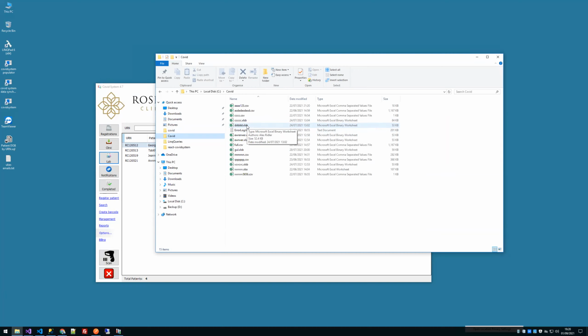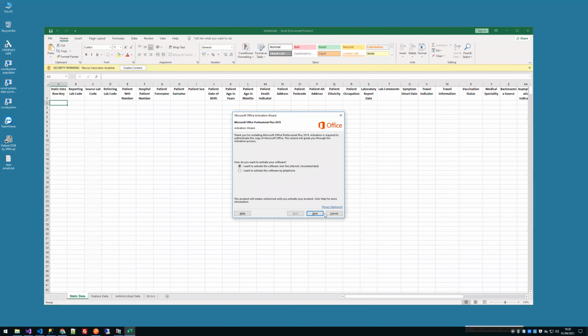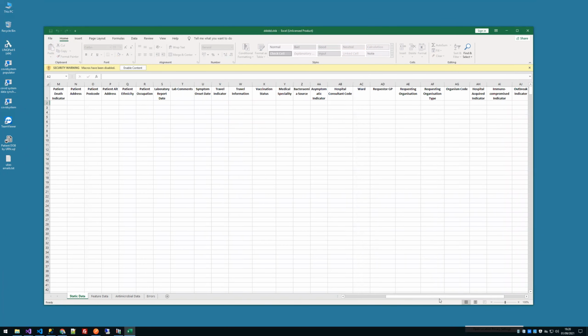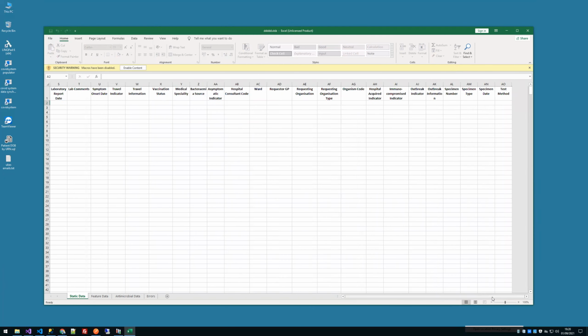The PHE side of things, they work out whether it's a red or amber country. Ah, so the PHE doesn't... So really, the lab has to do it? Say that again, sorry. I thought it was the lab that had to submit it to them. What if it's amber, green, or red? No, I think it's the actual... then send it back.